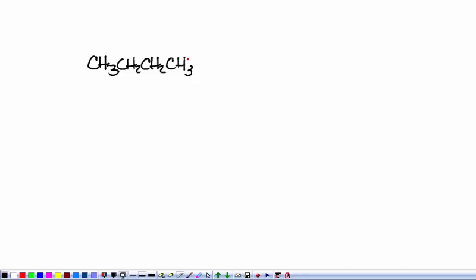What was my question? My question was, how many sets of non-equivalent hydrogens are there in butane? In propane, there were 2. The CH2s were one set, and the 2 CH3s were equivalent, and they were a second set.